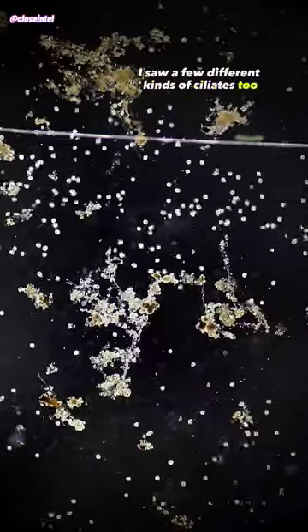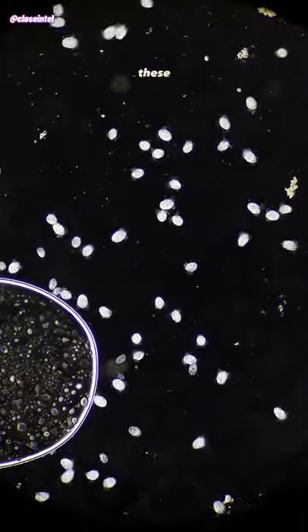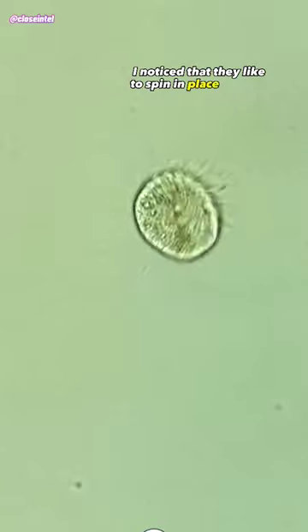I saw a few different kinds of ciliates too, and the most abundant ones seem to be some kind of Halteria species. These ciliates kind of bounce or jump quickly through the water and feed on bacteria or other small protists. I noticed that they like to spin in place a lot too.